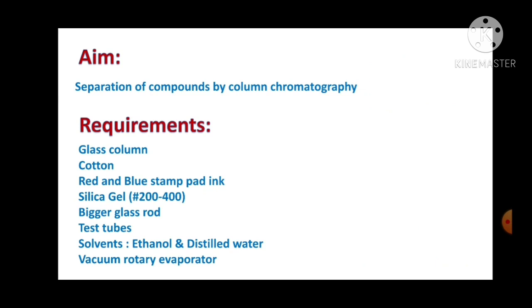These are the requirements to perform the experiment. We require a glass column, cotton to hold the stationary phase, and red and blue stamp pad ink as a sample — we have mixed them together. We require silica gel, the widely used stationary material; the commercially available silica gel specially made for column chromatography with mesh size 200 to 400. We also need a longer glass rod to pack the stationary phase, test tubes to collect fractions, a solvent system of ethanol and distilled water, and optionally a vacuum rotary evaporator to reuse solvents.